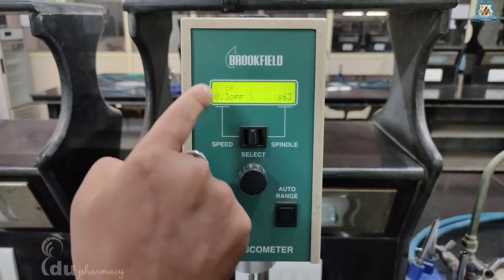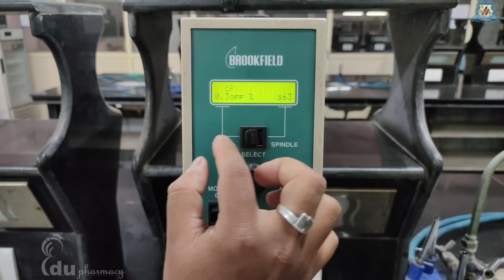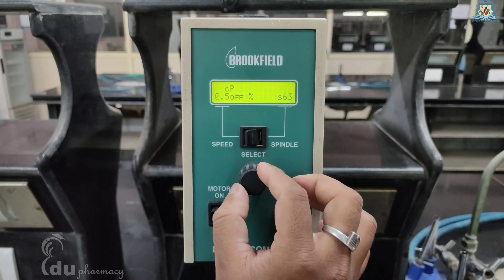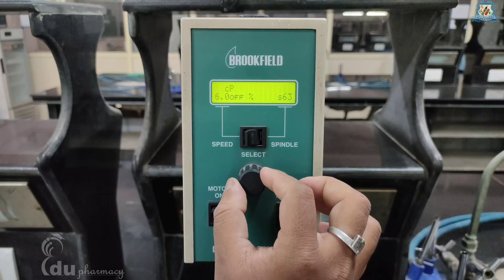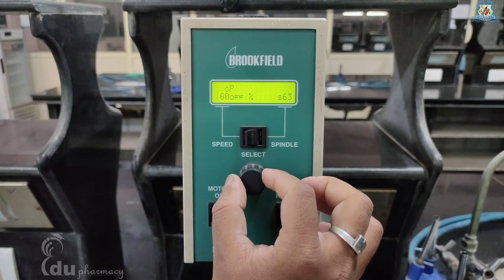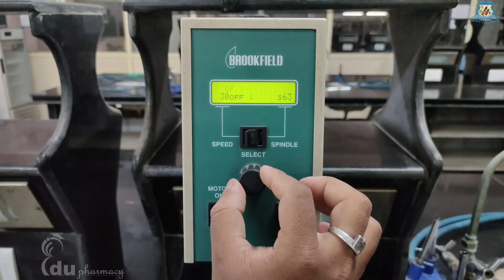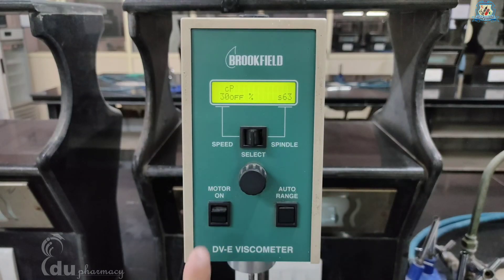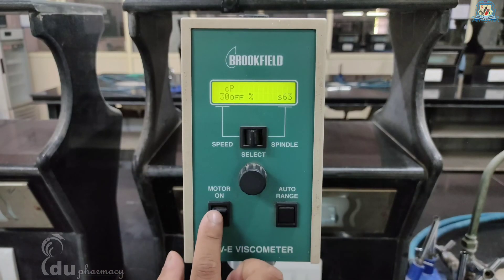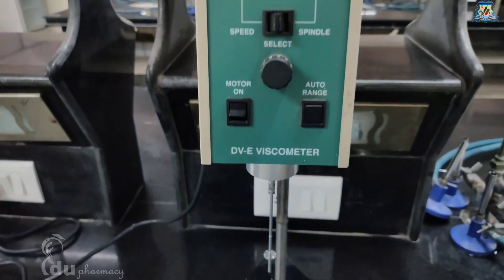Shifting the speed/spindle switch to the left position will allow you to adjust the speed selection. The select knob can be rotated until the desired speed is selected. There are 18 rotational speeds available on the DVE viscometer, ranging from 0.3 to 100 RPM. Once the desired speed is shown on the display, set the spindle/speed switch to the middle position, then turn the motor on switch to the on position — the viscometer will rotate the spindle at the selected speed.